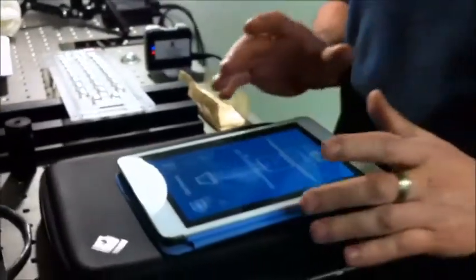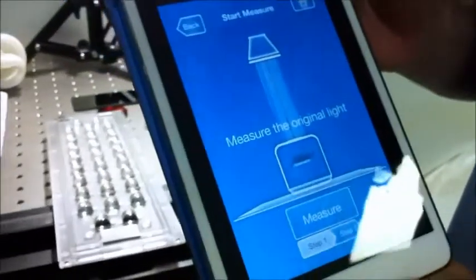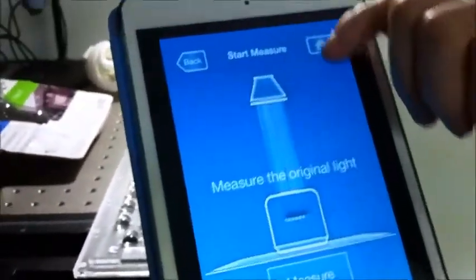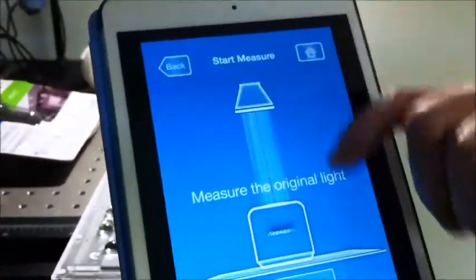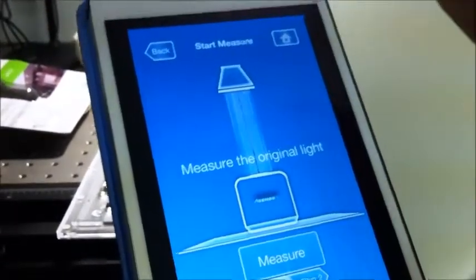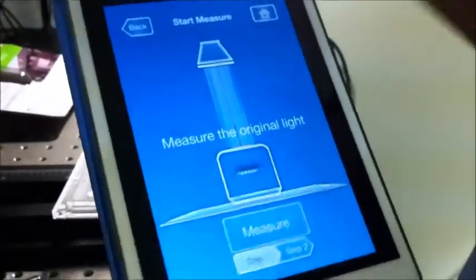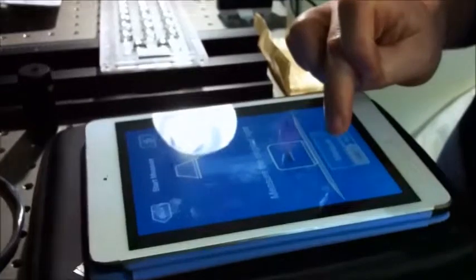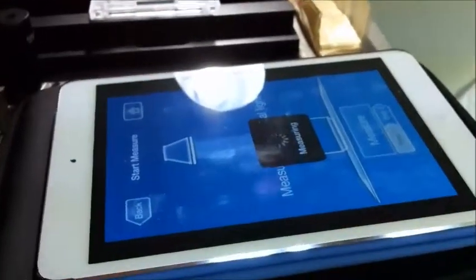So we're ready to measure. You will see this nice window here, showing the measurement — starting by measuring the light only. This is the light shining on the spectrometer, and then we do a first step measurement. It measures right now.